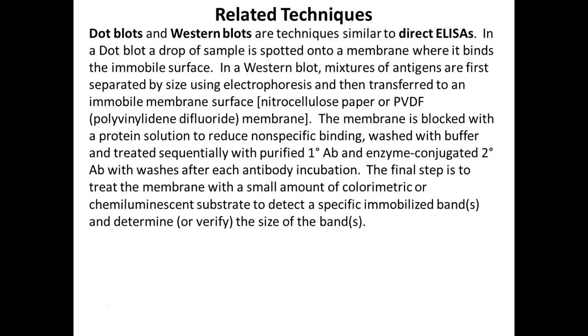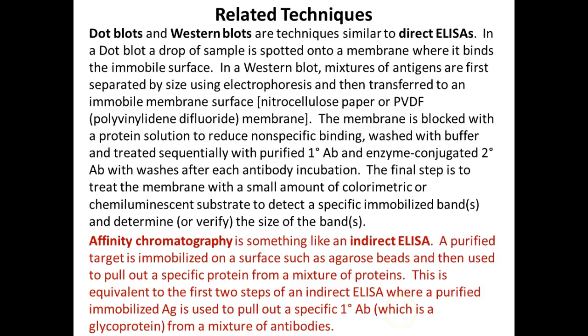But in this case, a lot of times the proteins on this strip have been spread out, maybe during electrophoresis, to separate the individual proteins from each other, so they can tell which protein, what size, the antibodies are actually sticking to. So this is used a lot in research. It's much more specific testing and used a lot for protein assays more than anything else.